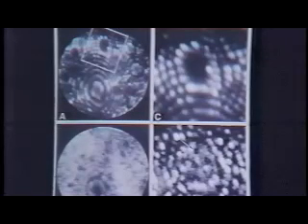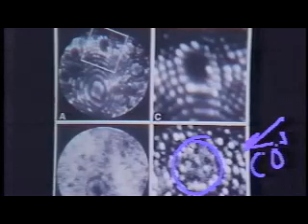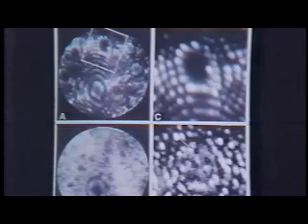And we're going to take one of the higher index planes that normally in a field ion image shows contrast at the edge, as they all do, as we told you. But if I adsorb CO on the surface and pop it off, this is a CO plus image of the surface. I can see detail near the center of the plane, including vacancies, these dark areas, that are normally not observed. And the only way you could observe them was by raising the field, evaporating the plane away slowly, and looking for their absence in the ion image.